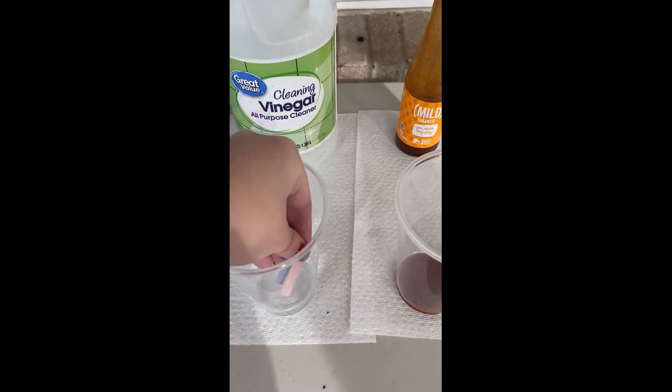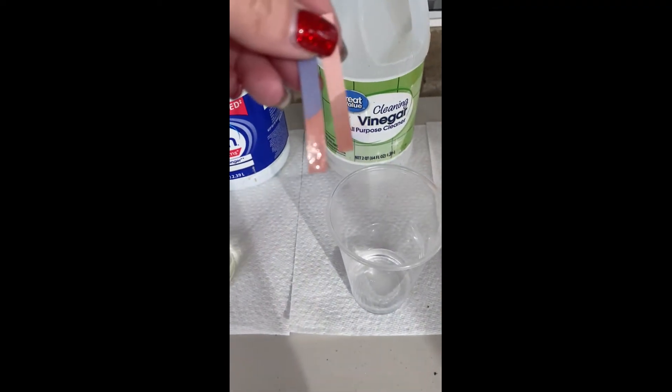Vinegar is up next. Go ahead and dip it and look at what color it turns. You can see that the blue litmus paper turns red, so this is going to be an acid.